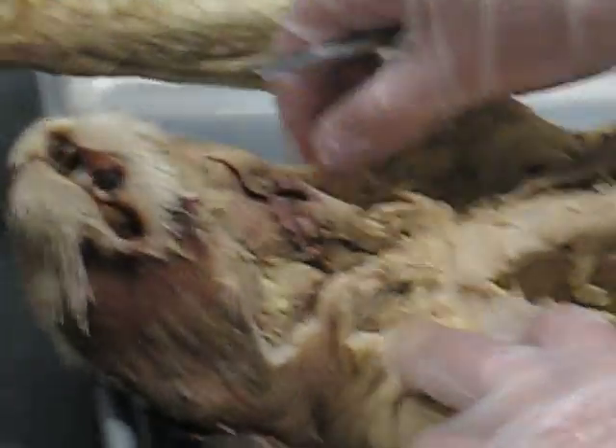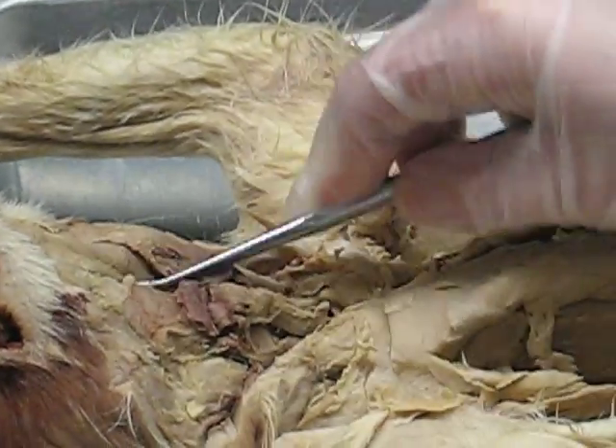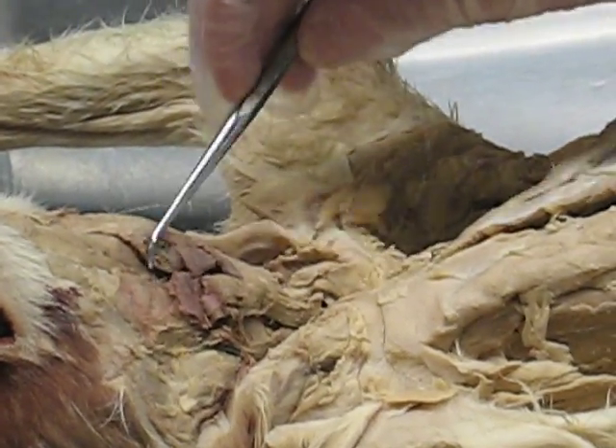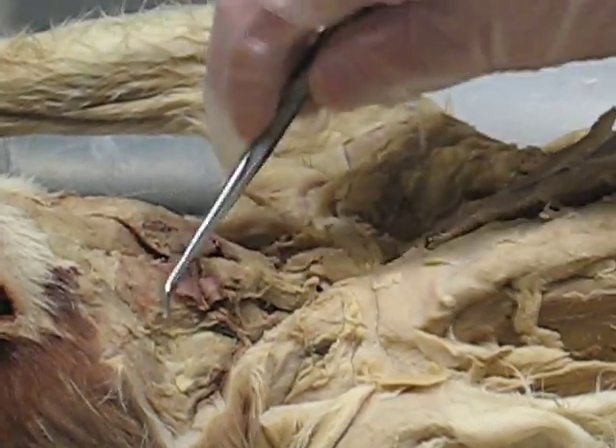Now we look at the neck muscles. This cat's good for the neck muscles. You have the digastric — the V on the underside of the neck. This is the digastric. This is the mylohyoid. So you have the digastric and the mylohyoid.